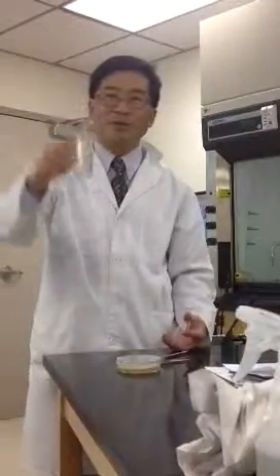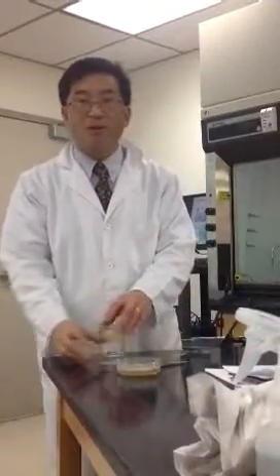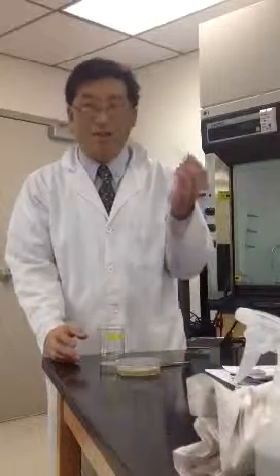Yummy. All right, so let me show you how to do this. Now, this is alcohol. We're going to be dipping this in alcohol and flame it to sterilize the forceps. The other thing, each group needs to get one of these. This is an agar slant that we use to grow the molds.